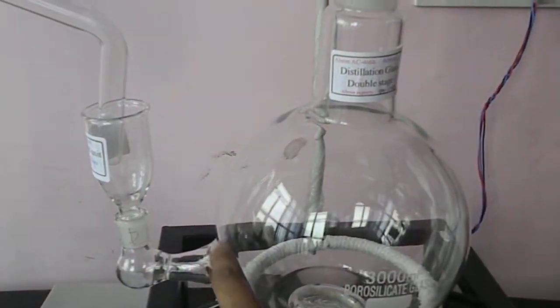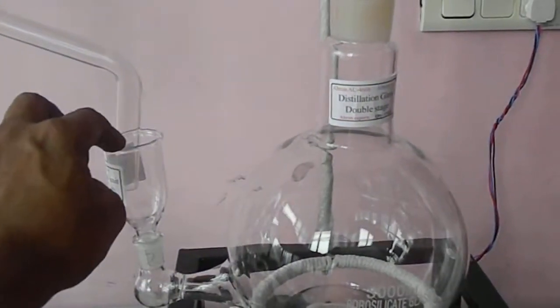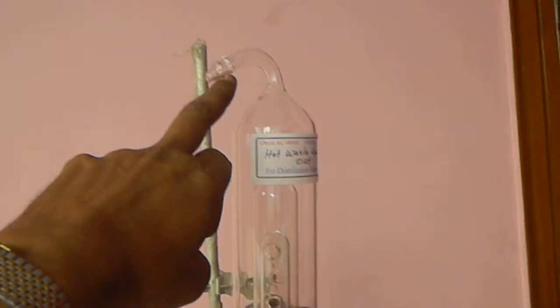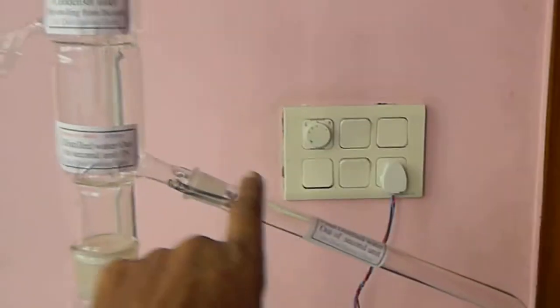Again the second unit will fill this flask. We will put another probe in this with one more attachment for cold water and hot water. This will go to the outside and to the waste water. Distilled water will come out from this.